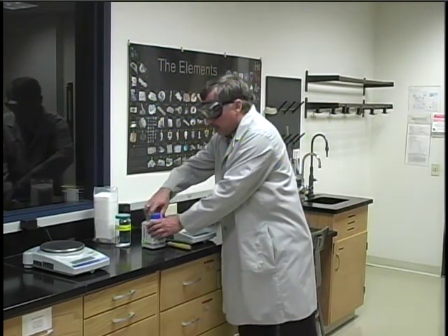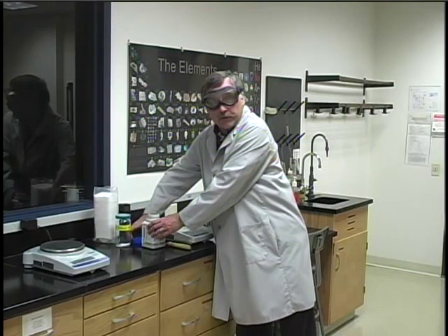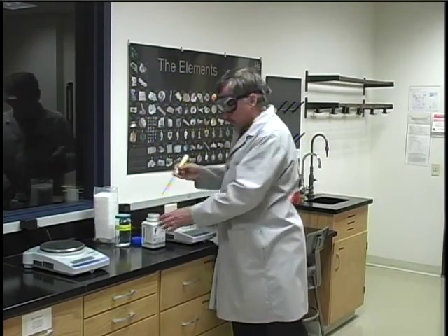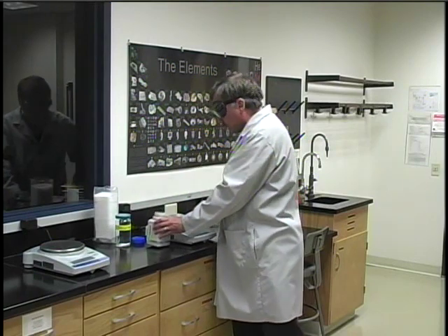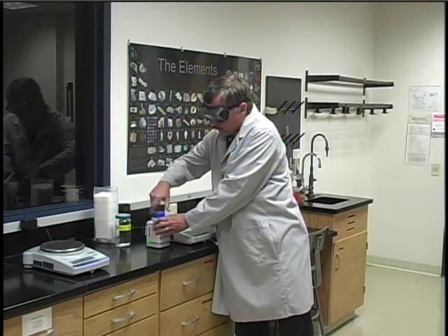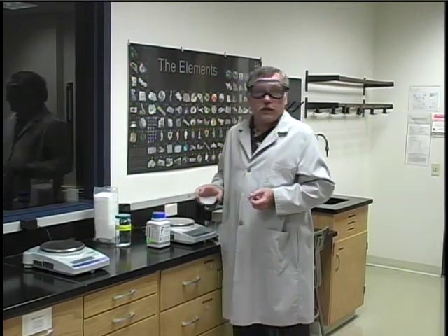The first is that you never return unused chemicals to the original reagent bottle. So if you find that you have accidentally taken too much of a chemical, you have only two options. The best one would be to give the excess chemical to another student — that way the chemical doesn't go to waste.